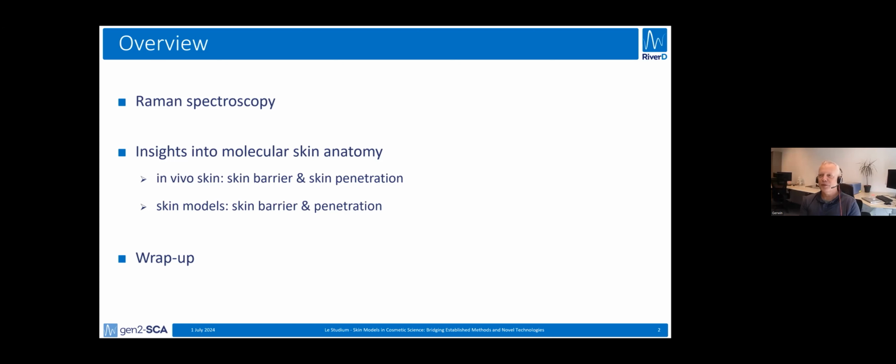So a brief overview of what I'm going to be talking about. I will very briefly introduce Raman spectroscopy and then show, in not too much detail, but sufficient detail, I hope, what it gives in terms of insights into what I call the molecular skin anatomy. So not just the molecular composition, but also how that changes with depth into the skin.